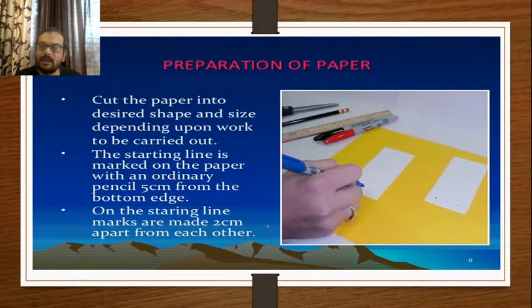Okay, and dependent upon the number of constituents which are going to be separated. If you have multiple components, you need to increase the size and shape of the filter paper, and if you have a very limited amount of sample available, you can go with the reference and then only the sample, so that you can reduce the size also.